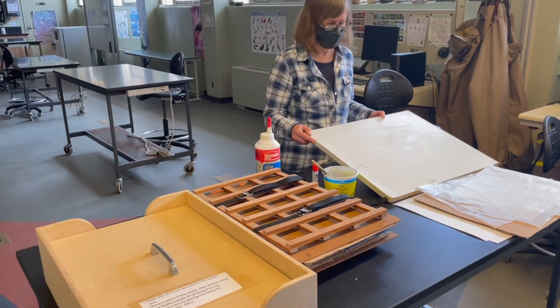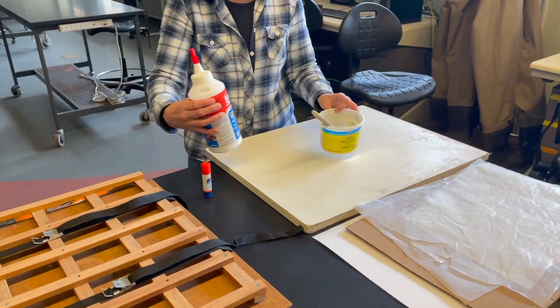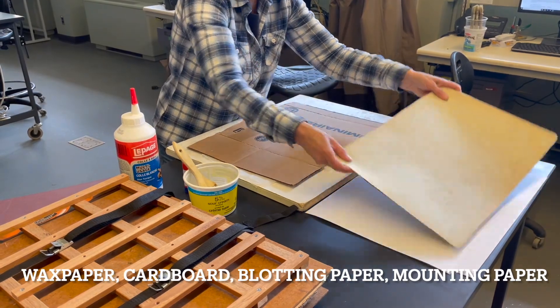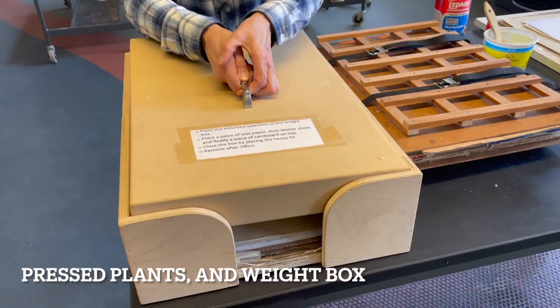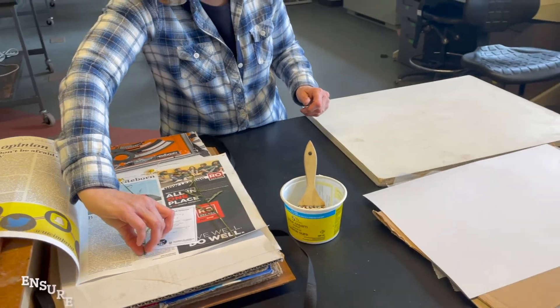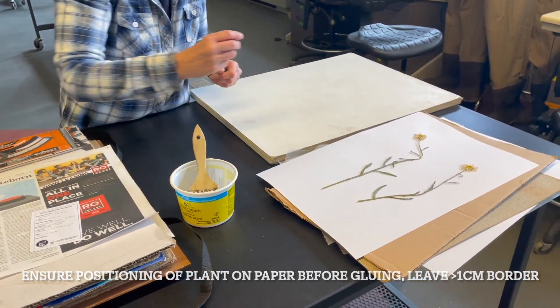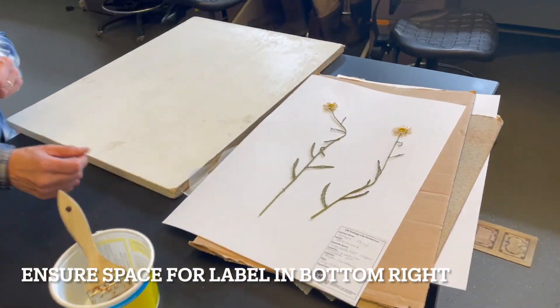To mount the dried pressed plants we will need a painting board on which we will paint a one-to-one ratio of white glue to water, wax paper to prevent sticking, cardboard, blotting paper, the mounting paper, our pressed plants and the weight box where we will put our mounted plants. First place the dried plant on paper to determine how to best position the plant. Be sure to leave at least one centimeter of border and consider where the label will go in the bottom right corner.